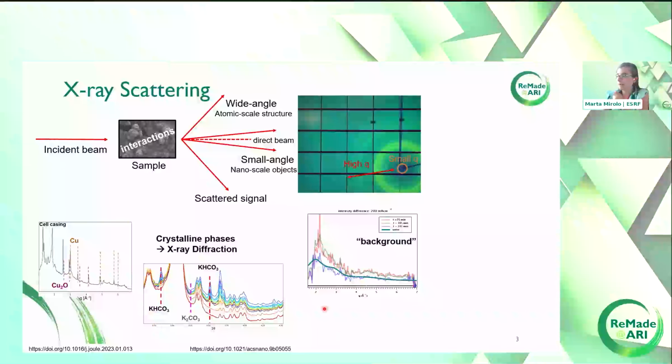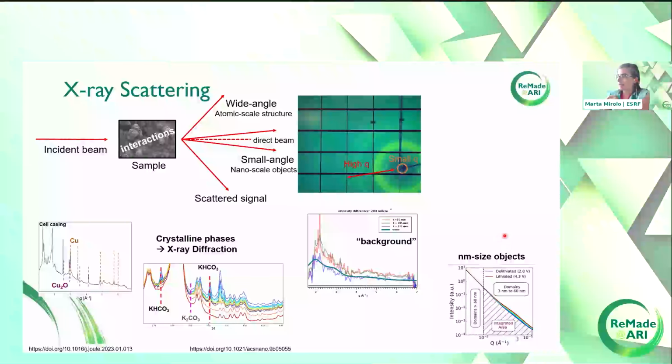And as a plus, when you go to a synchrotron, you get more information. For example, you can look at the background, you can look at water movement in an electrochemical cell. This information is not available when you look at data collected in a laboratory XRD, simply because of the intensity of the beam. There are not enough photons to distinguish noise from background.